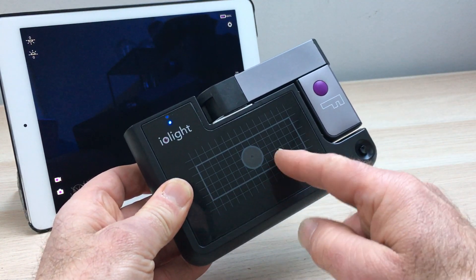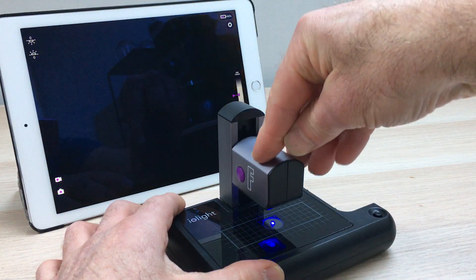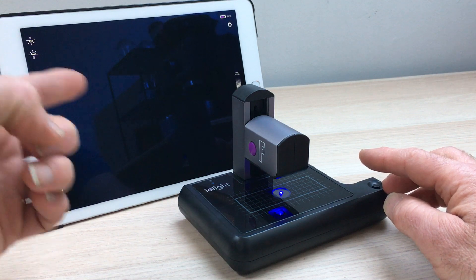The sample goes on the glass stage here and is illuminated with a blue illuminator from below. The camera in the top of the microscope takes images of the sample and transmits them directly to a smartphone, tablet, or computer.